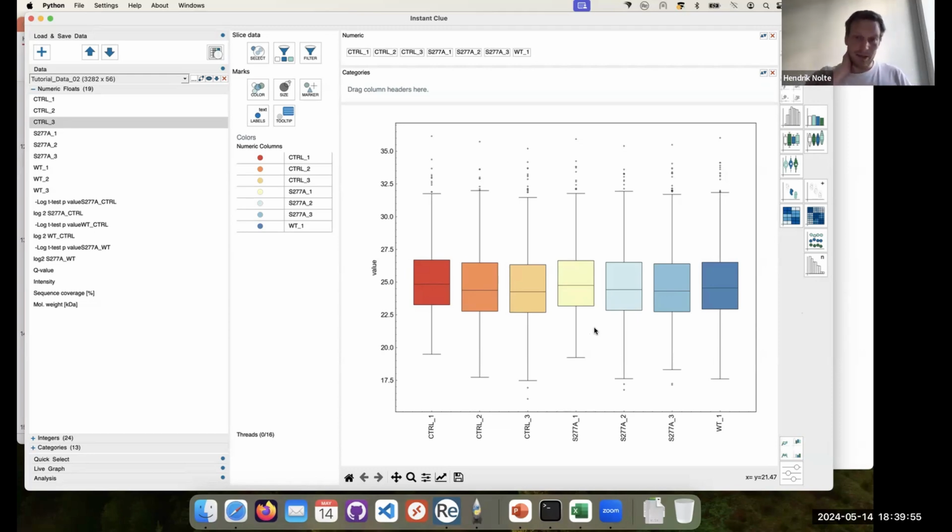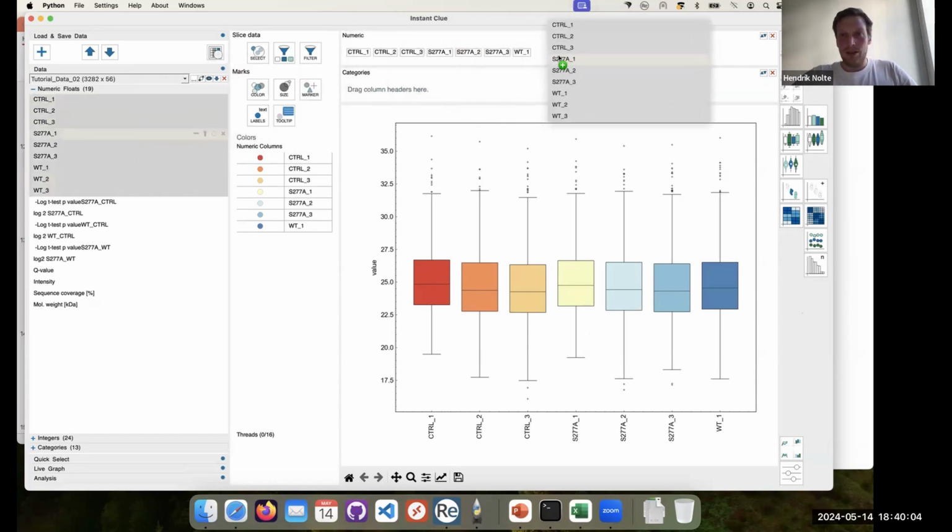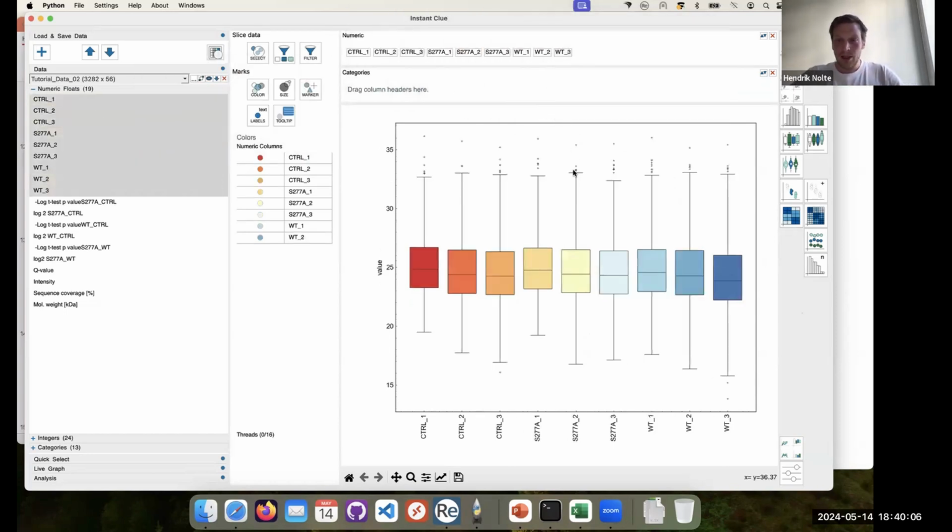Yeah, exactly. I mean, this is an IP even, so it's a bit different, but yeah. But of course, you should always plot all of your samples. I mean, it's something like this, and you can indeed see that there is some variation here. Yeah, this data set is, I think, relatively old. So the machines and the workflows have become much more reproducible, and usually we don't see this much of a change anymore in proteomics data.